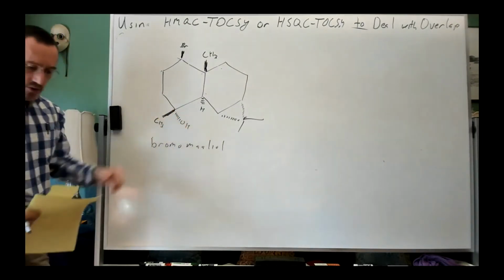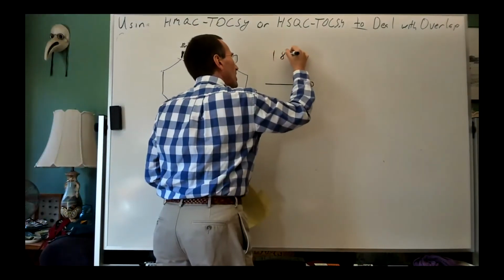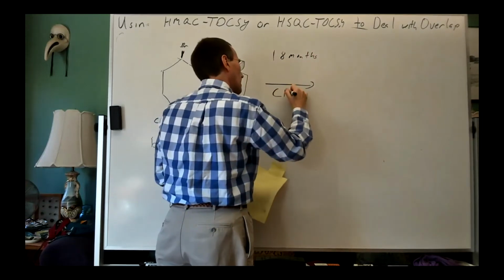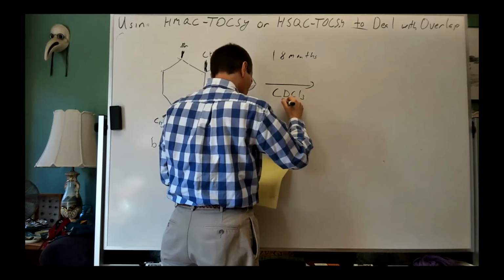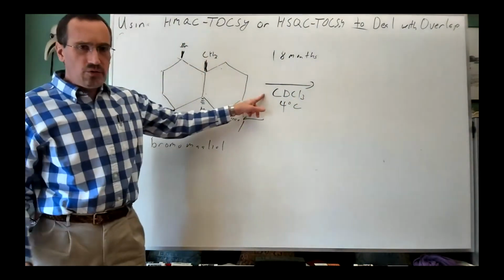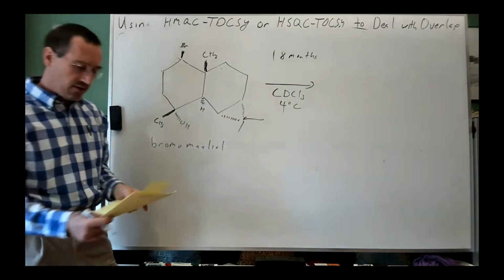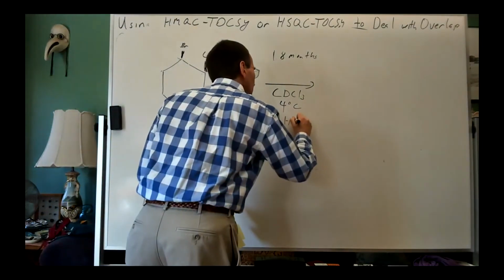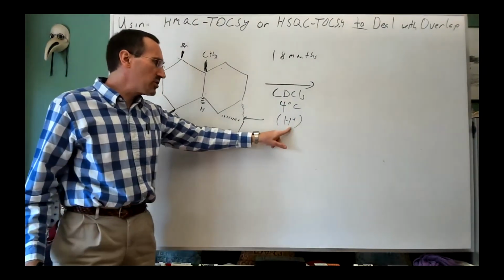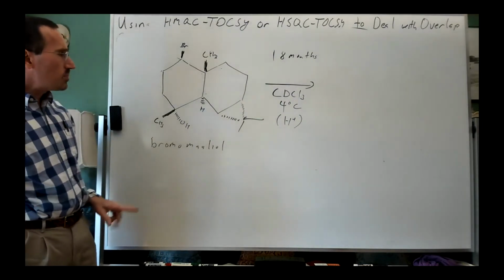So this compound was left in an NMR tube in the fridge for 18 months in deuterochloroform. What happens is chloroform oxidizes to give acid, to give catalytic amounts of H+, or more specifically D+. So basically you get a chain reaction, a catalytic reaction that's driven by H+.